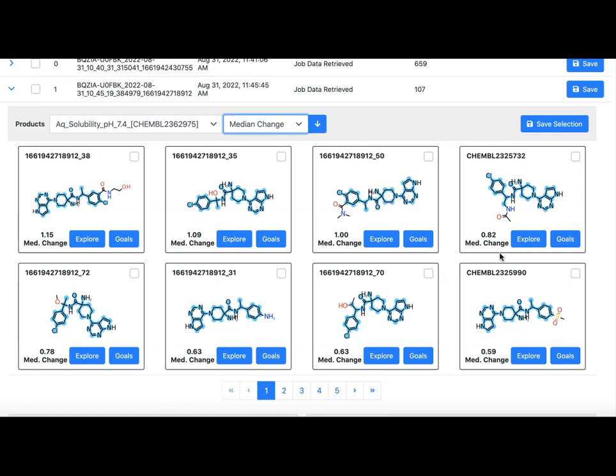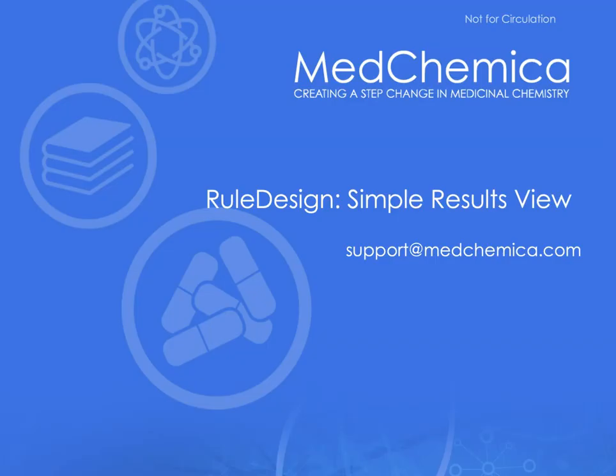So, there we have the rapid method of looking at results. We can see sensible compound suggestions with evidence to support synthesis. That concludes this short training video on rapid results viewing in RuleDesign.